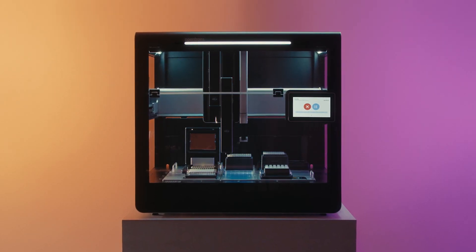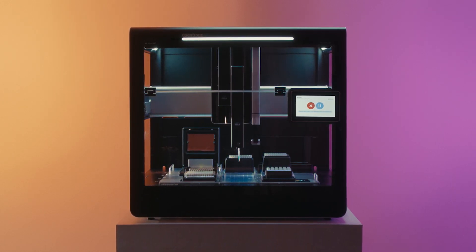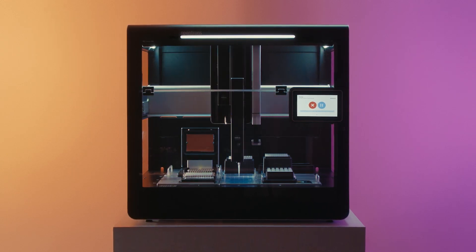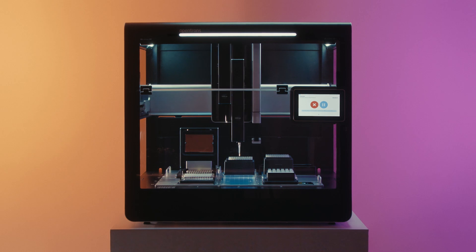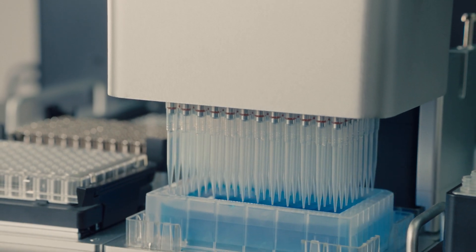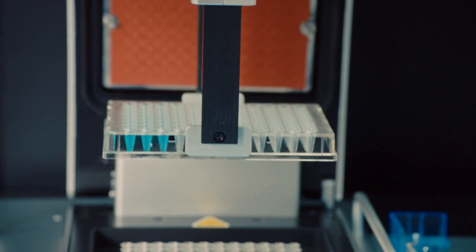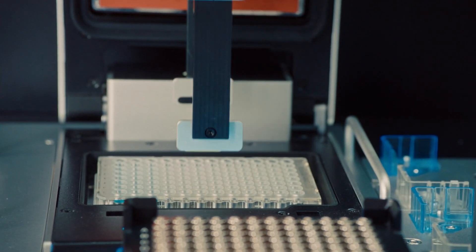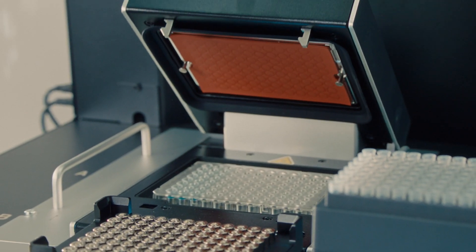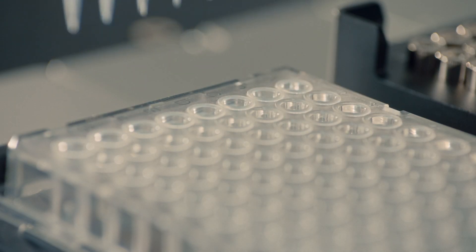The Flex Robotics System is our latest robotics platform that's been completely built from the ground up to be focused in having a highly flexible tool that fits your needs. It is a far more capable system able to drive more than 10x the throughput compared to our OT2 platform. We really wanted the robot to be a system that lets you run your experiments the way you want, not forcing you to modify your protocols and processes to fit the constraints of traditional automation systems.